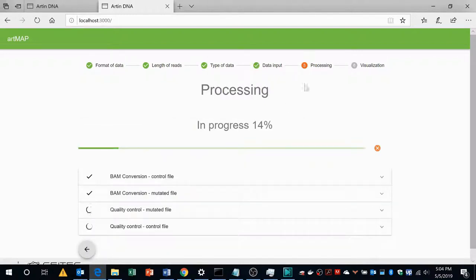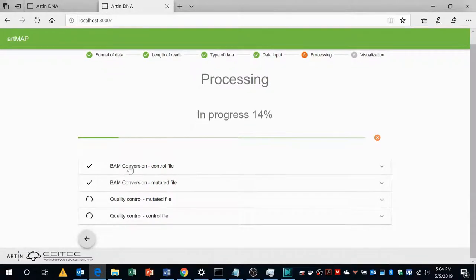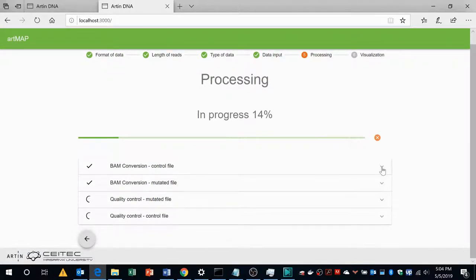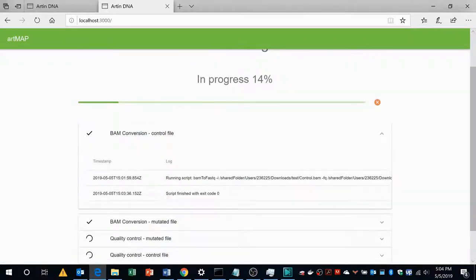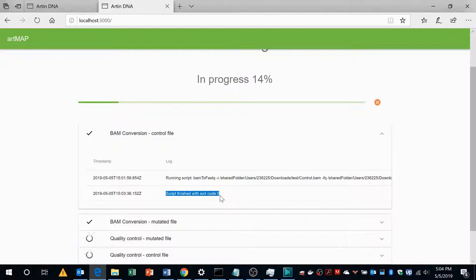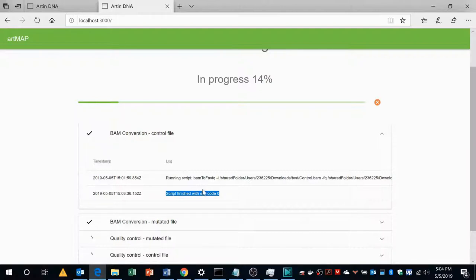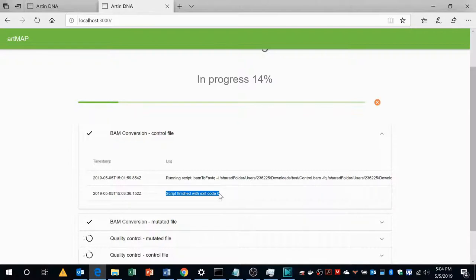Go back to processing. Now both the control and mutant file has been converted from BAM to FASTQ and you will see a message saying script finished with exit code 0. Exit code 0 means that there is no error during this script, but if there is exit code 1 then there is an error and we need to check what is the error and we need to solve it.